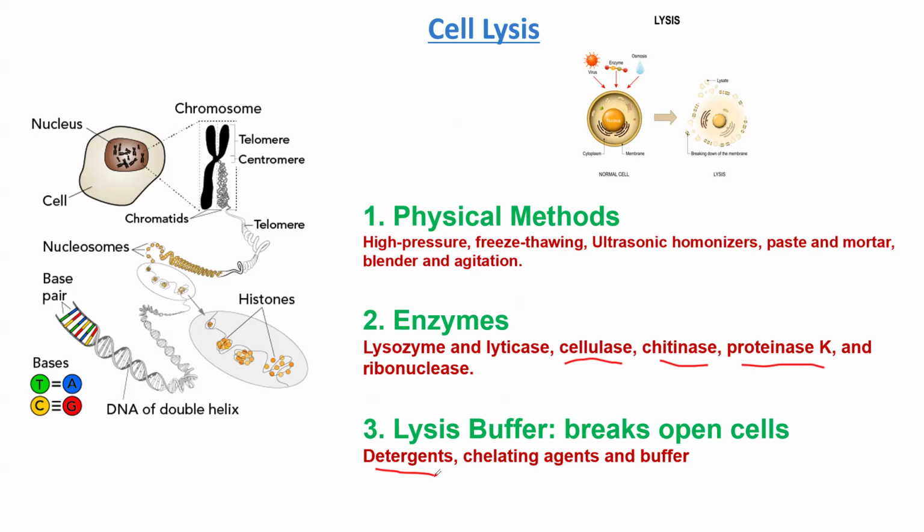Once they bind to them, the DNase, which is the enzyme required to digest DNA, will no longer find available magnesium to bind. If there is no available magnesium ion, the DNase, that is the deoxyribonuclease enzyme, will not be active. It will remain inactive. Therefore, this will prevent the DNA from degradation.